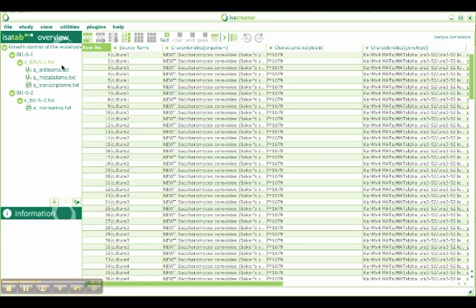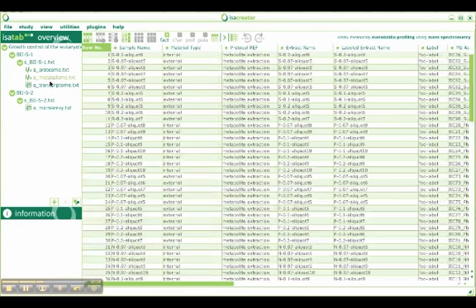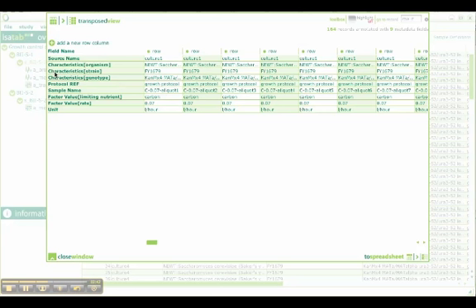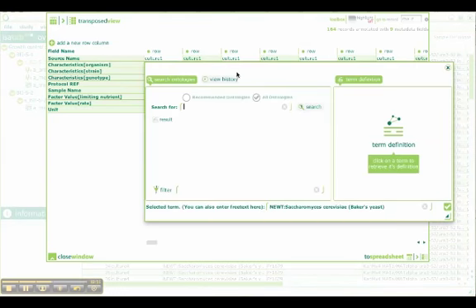Now let's have a look at the other documents that make up this study. So we have the study sample spreadsheet, and then three spreadsheets containing the assays, one per technique or assay as we define them. An interesting bit about ISAcreator is that it allows you to have an Excel-like display, but if you don't like it, you can also have a transposed view, which shows every record as a column, and you can see the different components here. And again, the widgets that are available in the tool are also available from this view, so the ontology lookup is available here.